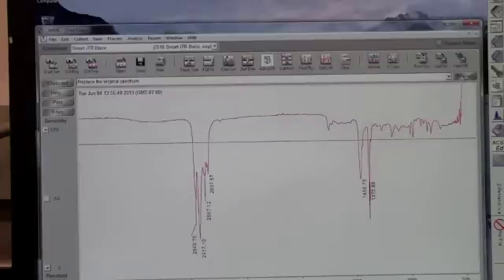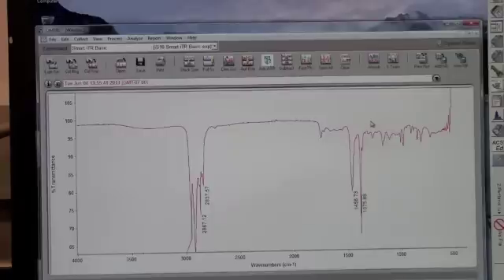Next, click on Replace and then Ctrl F in order to resize the graph.